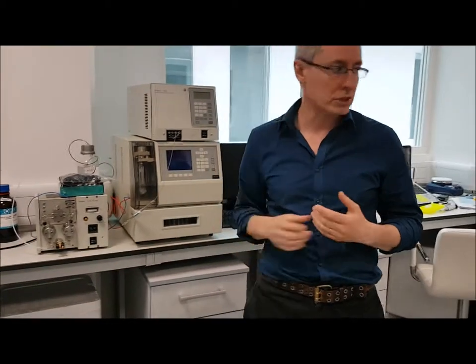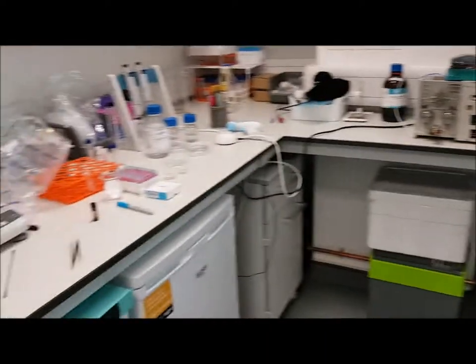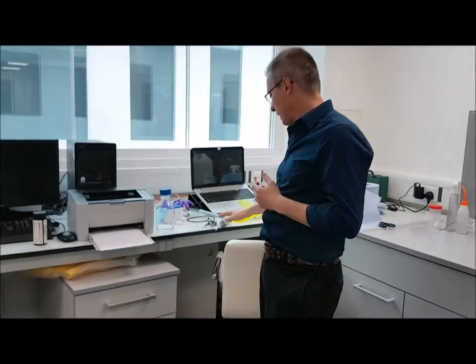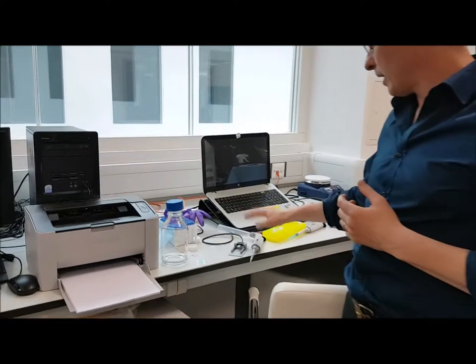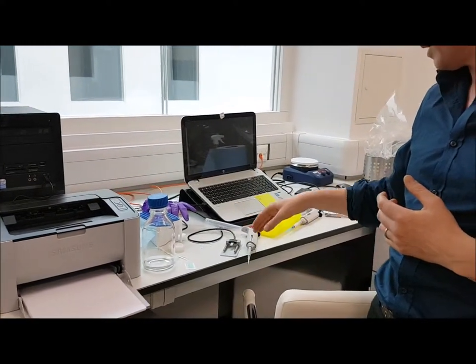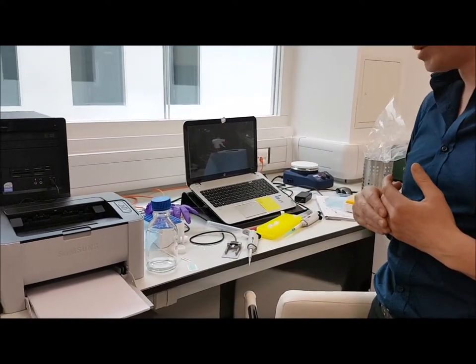Obviously, there's freezers and fridges in here for the various biologies. Over here at the moment, we're doing electrochemical assay development. We're just in the middle of completing that now.